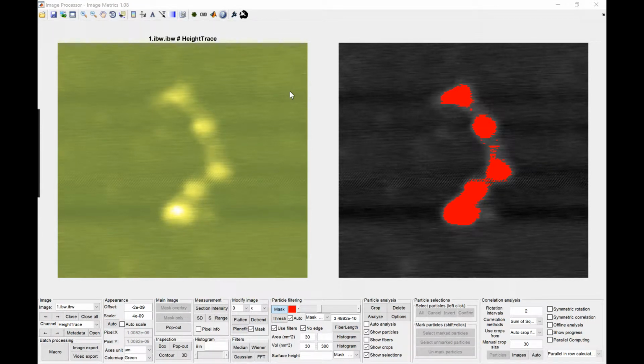In this video, I'm going to show you how to do image inspection. So basically, you want to zoom in on an area to inspect it carefully, to look at the pixels, to look at each value x, y, and z.